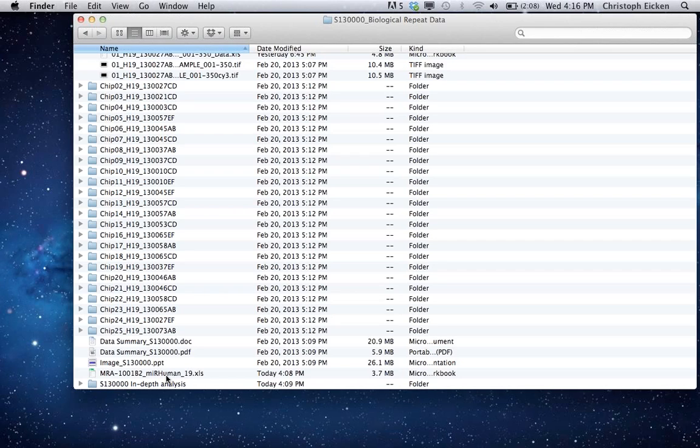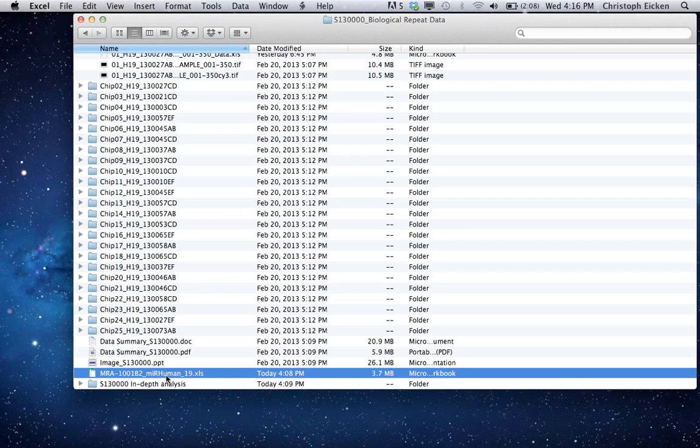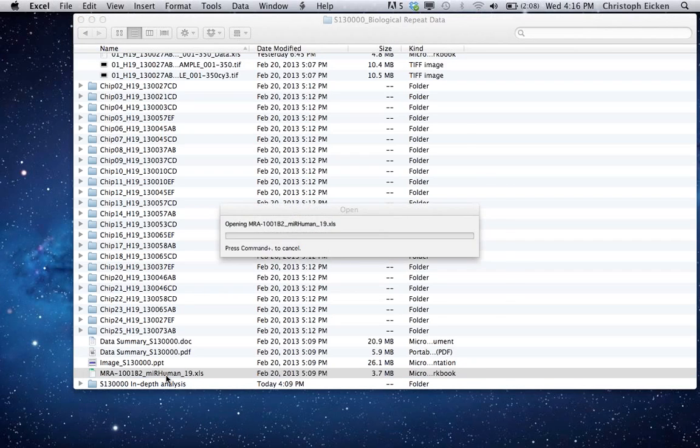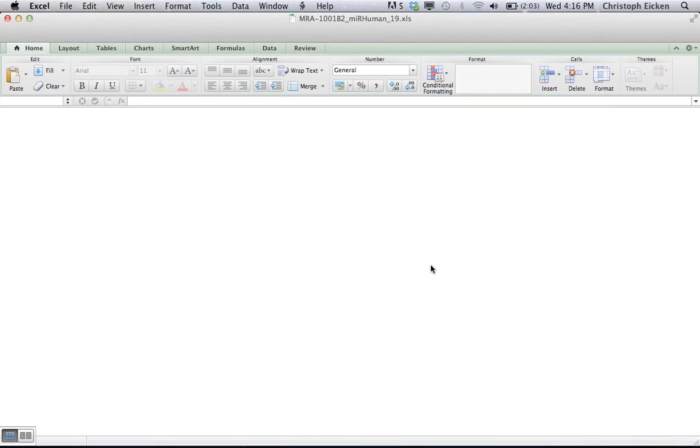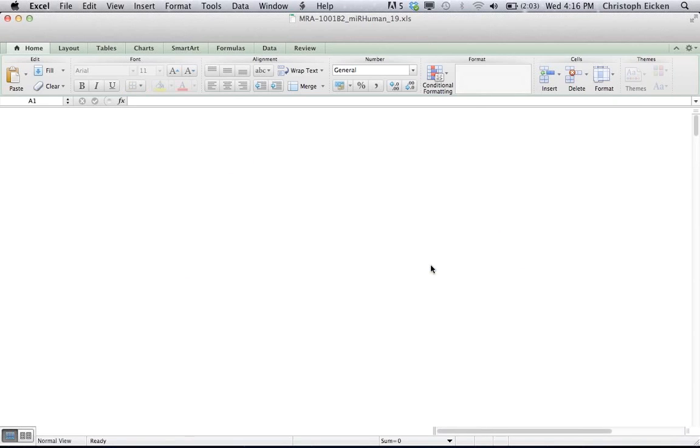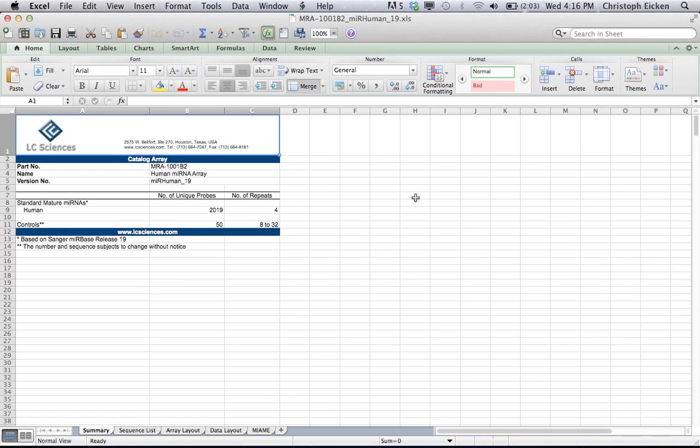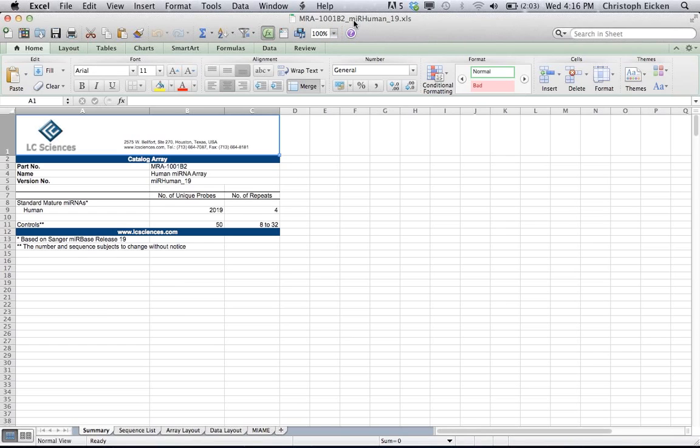This Excel file here is the actual chip layout that was used in your experiment. So it starts always with, the file name starts with MRA dash and then it has the part number. That it's a microRNA array is indicated by MIR, then species followed by the miRBase version.